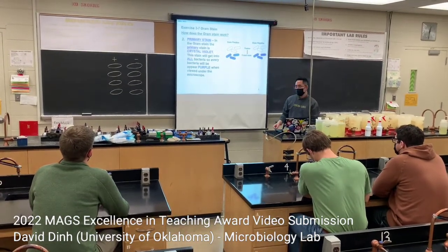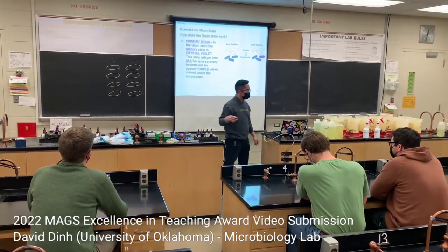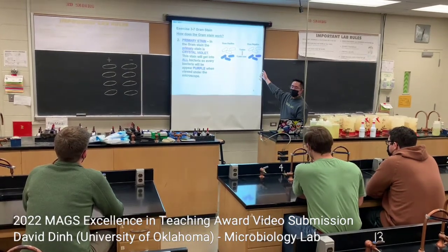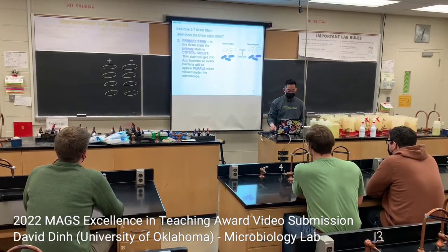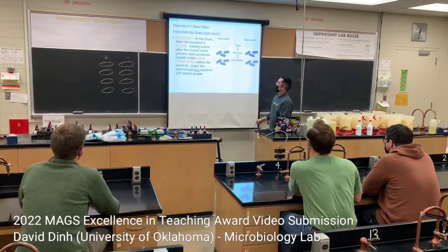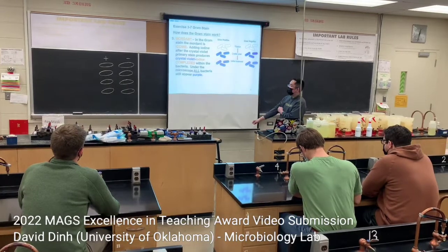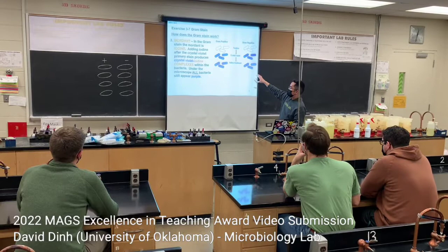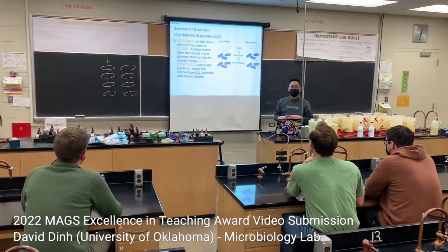And then we add the primary stain. You should have all the stains in front of you. The first stain that we use is crystal violet. That will make both gram positive and gram negative organisms purple, right? It will stain all the bacteria purple. And then we add a mordant. That mordant is iodine, which is the next bottle over, and it creates a crystal violet iodine complex. So both gram positive and gram negative will still be purple.